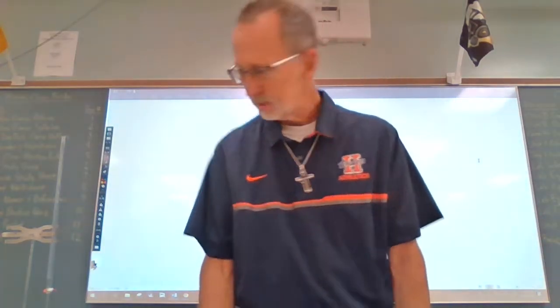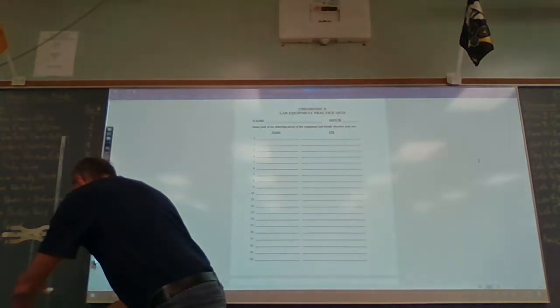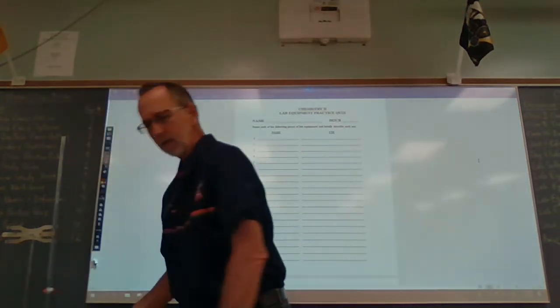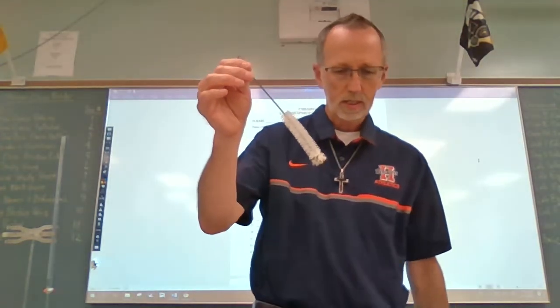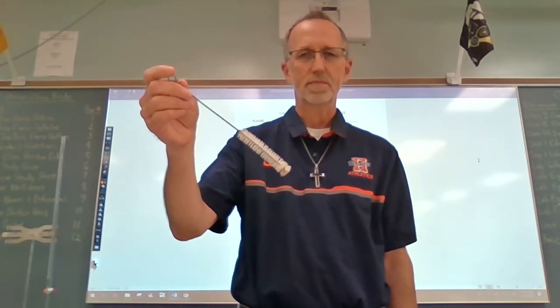Next, test tube brush. So this is number 10, test tube brush. As you might guess, this is used to clean a test tube.